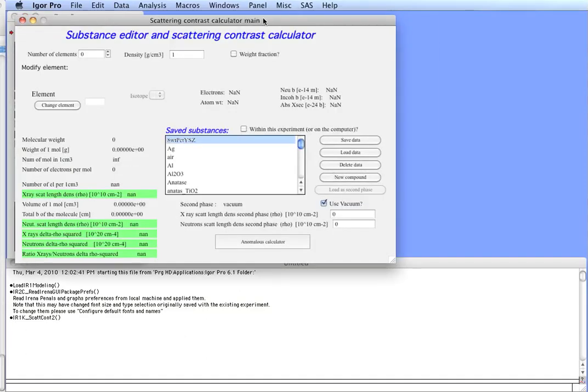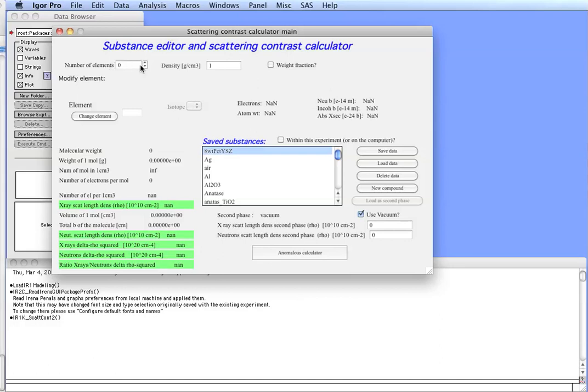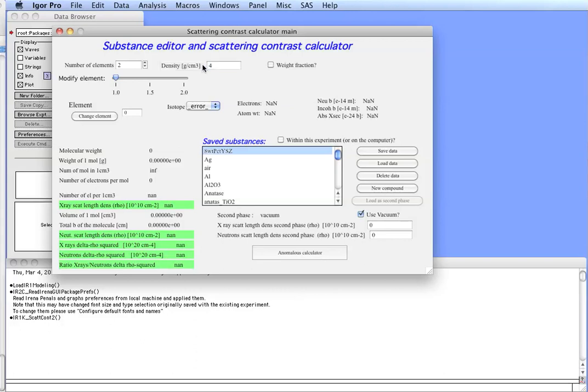At this moment we have a main panel for Scattering Contrast Calculator in which we can create a compound to be used and analyzed. First, let's create aluminum oxide. So, number of elements is aluminum and oxygen, that's two. This specific material is about 4 grams per cubic centimeter density.